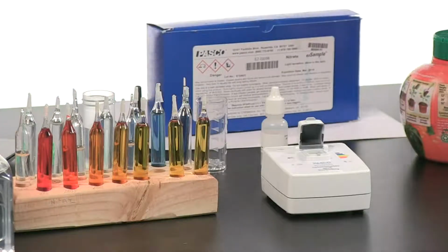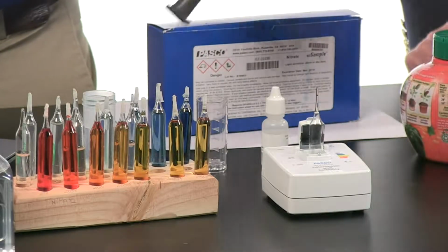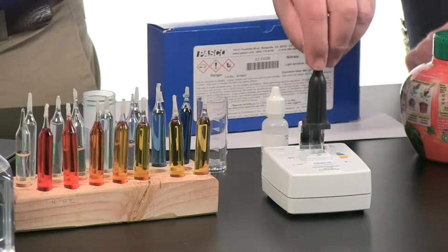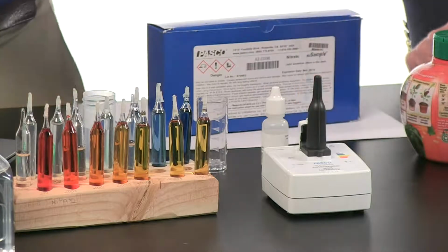Right. And so what happens is that these pre-mixed amounts, we're going to show how we mix those, can be put into that same space. They're 1 centimeter in diameter. They fit nicely into the cuvette holder of the colorimeter, and then you just need to block out light somehow. And because they're taller, we've added a little bit of a shade that goes on top to keep that light from goofing up how much light gets absorbed by these.